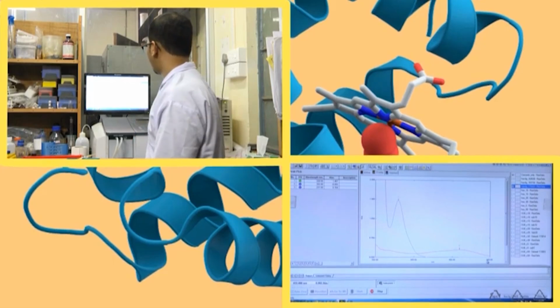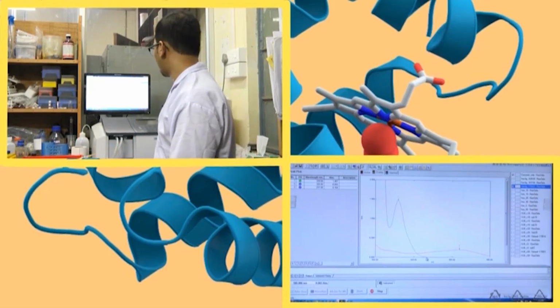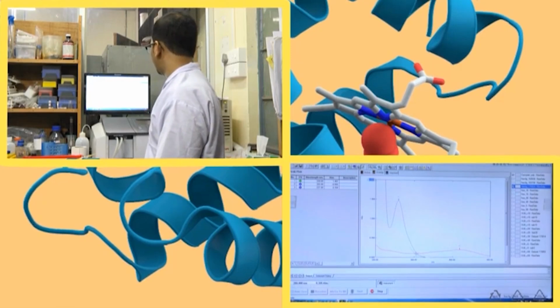The scanning is taking place here. Peaks are not observed since there is no absorption in this region. Here absorption has started. Here we can see a new peak emerges.